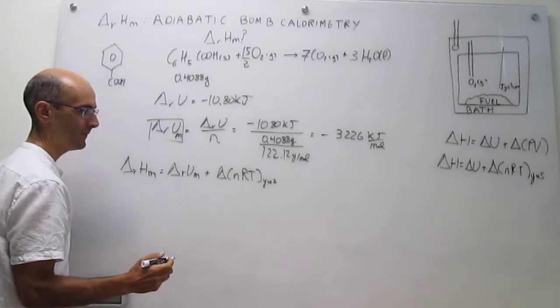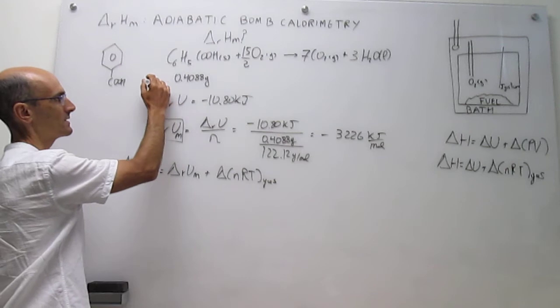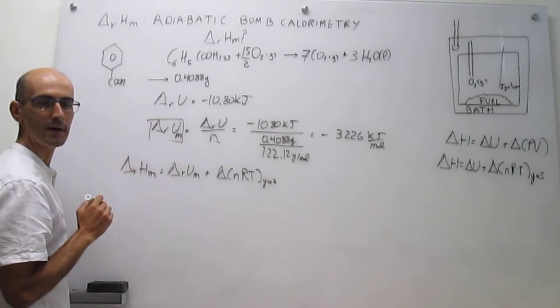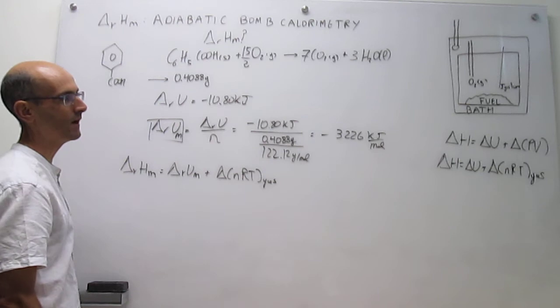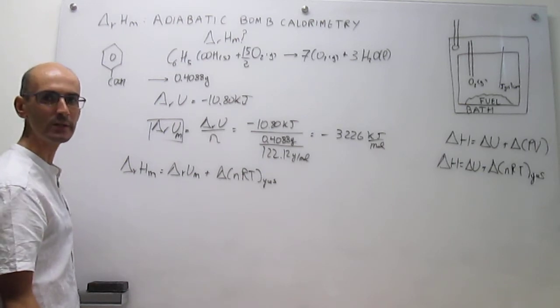All right, so the idea here is that you generally use such small amounts of material or fuel that the temperature actually is not changing dramatically. If you think about the change in temperature in the calorimeter, that was just 2 degrees.